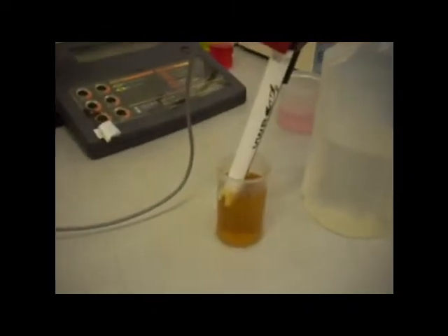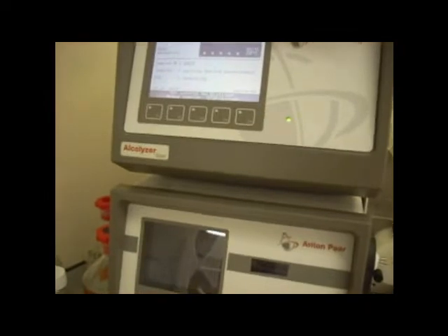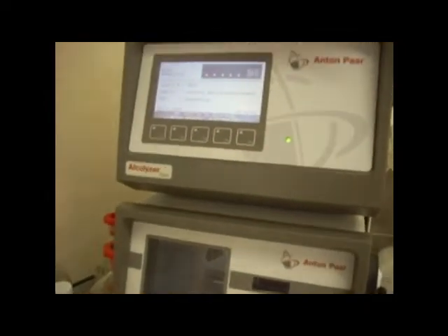This right here is going to check the pH of the beer. This machine checks original gravity, present gravity, and the alcohol content.